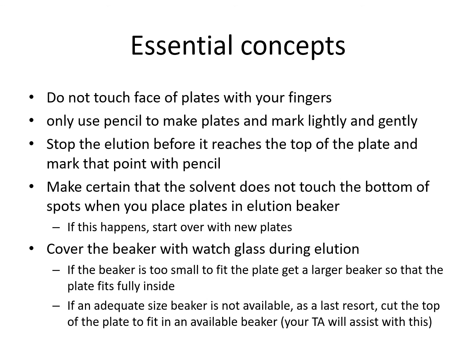Another thing is the environment of the chamber should be saturated. This will be done by covering the chamber with an appropriate lid. If you are using a beaker, you have to find a petri dish or watch glass or any flat glass to cover the beaker.